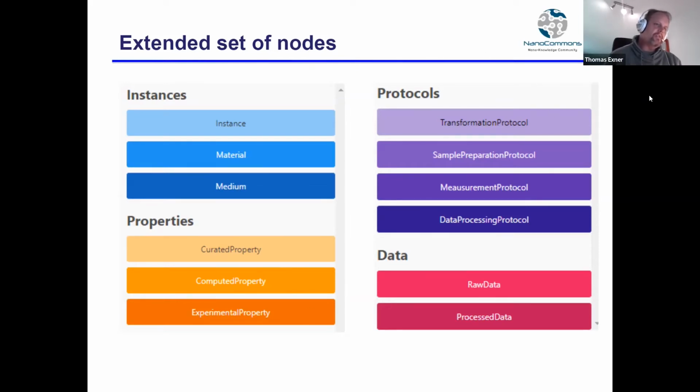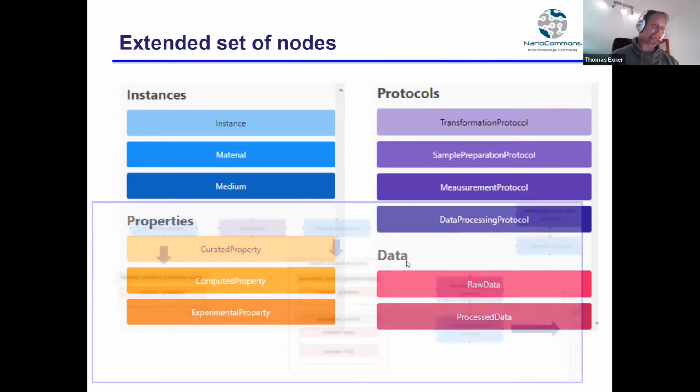The main point here is this part that we said, in principle, it would be good to also link protocols directly to that whole thing. It's not just data or the kind of data you measure, but you can also manage the whole process there by putting the protocols in as well as the data.